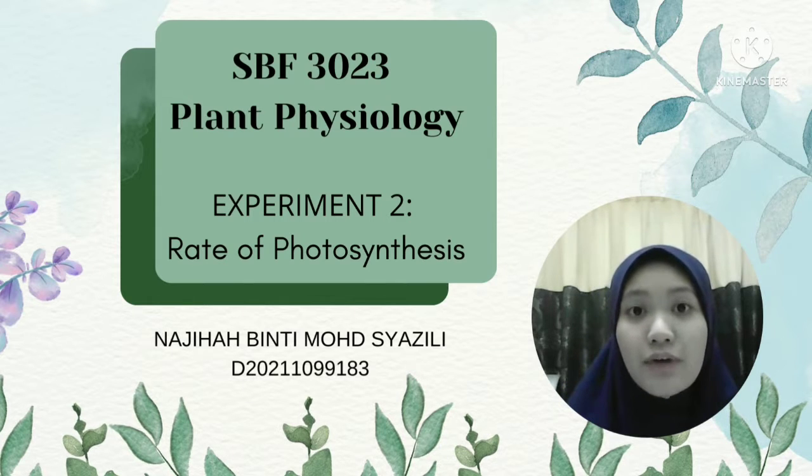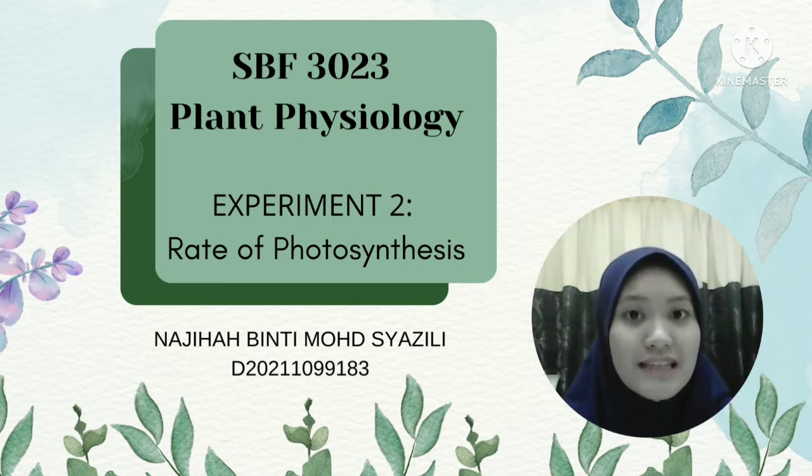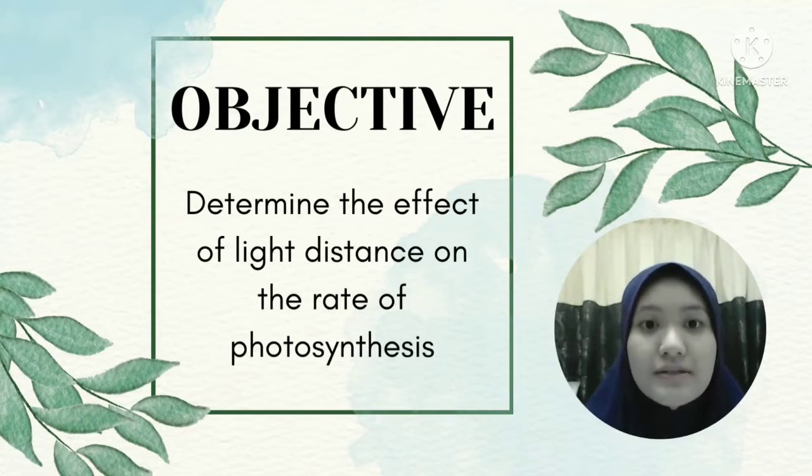Today, I want to carry out an experiment regarding the rate of photosynthesis. The objective of this experiment is to determine the effect of light distance on the rate of photosynthesis.